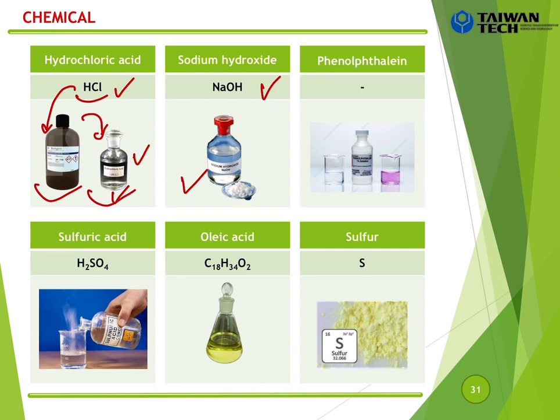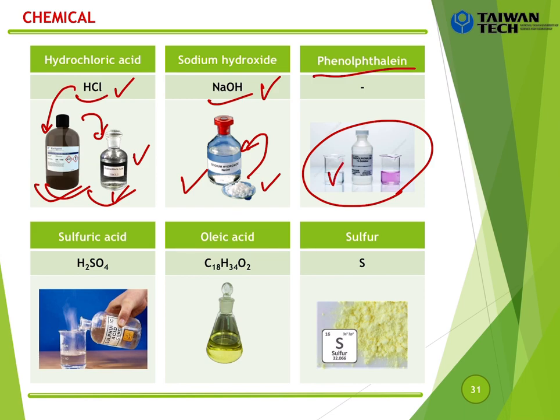In your stomach, a low concentration is okay, but the high concentration can damage your tissue cells, like your skin, okay? On average, NaOH is a solid. And when you dissolve it in water, you can get a transparent solution like this, okay? And we have the phenolphthalein. Phenolphthalein is an indicator. In acid, it is colorless. In basic solution, it becomes pink. So you add it to here or to here, and you can know whether it is an acid or a basic solution, okay?